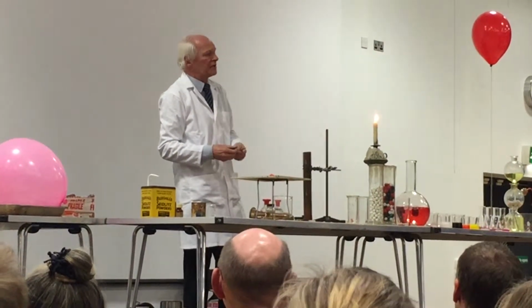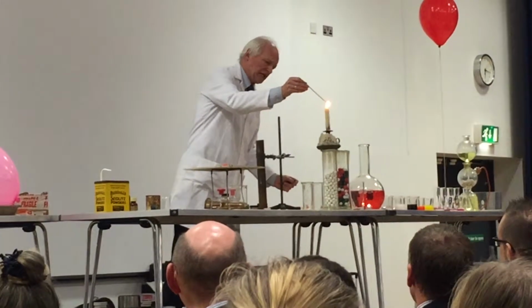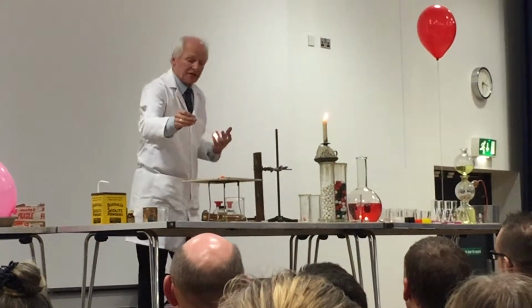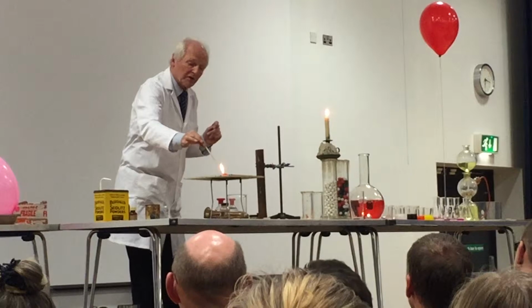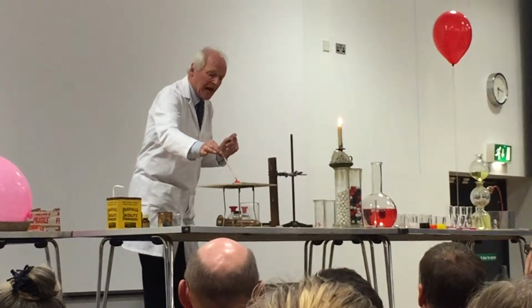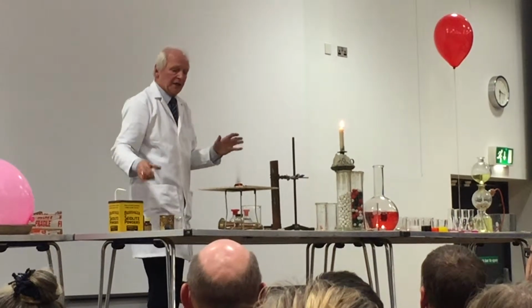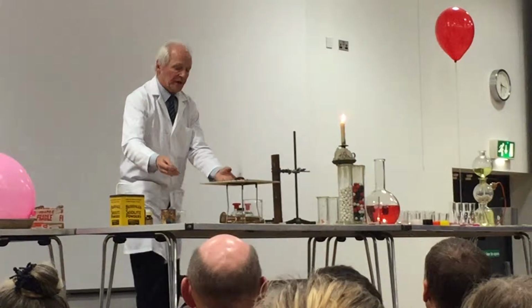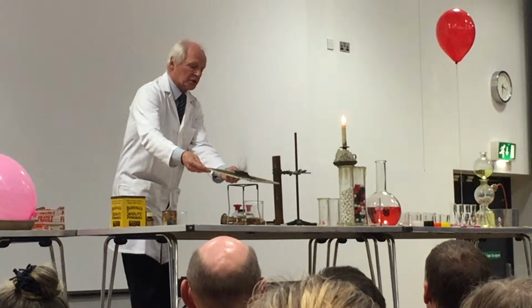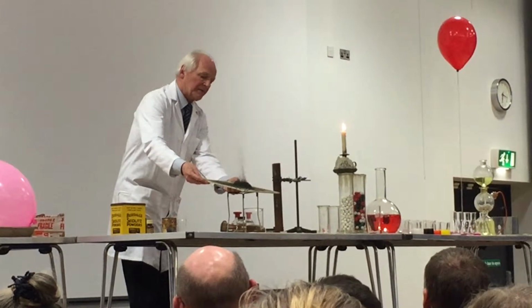And I just wanted to tell you, there is a particularly beautiful type of reaction which takes place when we actually put a flame to it. It's an example of a reaction. It resembles a volcano. Please watch carefully. It takes a little while. This is not easy to do, this reaction. And there it is just starting now, and I'm going to tilt it upwards so you can see it a little bit better. You see, it resembles a miniature volcano. There is a cloud of ash rising from it, just like a miniature volcano.